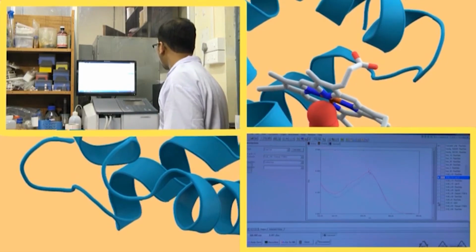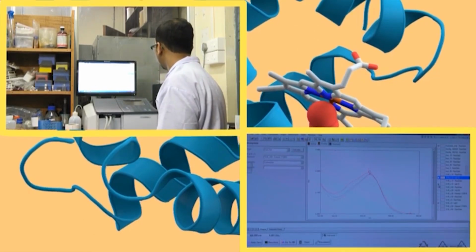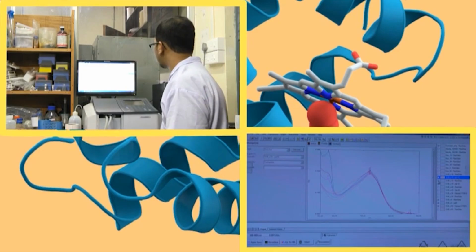Now, again when you are adding 10 microliter of HSA, what is happening? You will be adding another decrease in value. In this way, what we can see is that this value again decreases. Here we can see a bit of decrease in this value, okay, not this one, again this one. No, this one is actually the raw data, okay, this one, and finally this one. This one actually has protein.